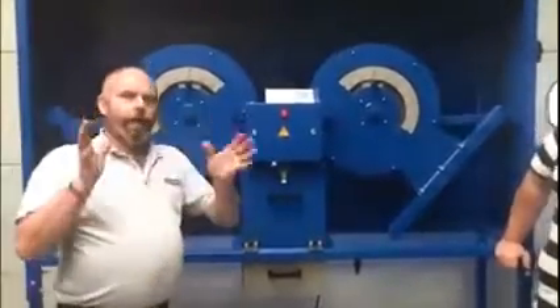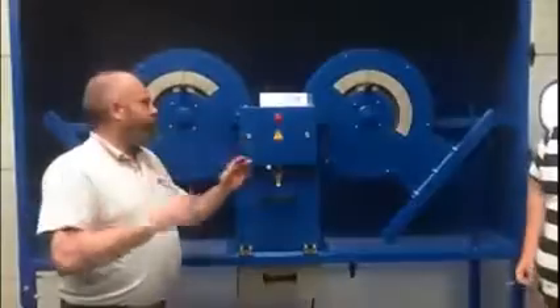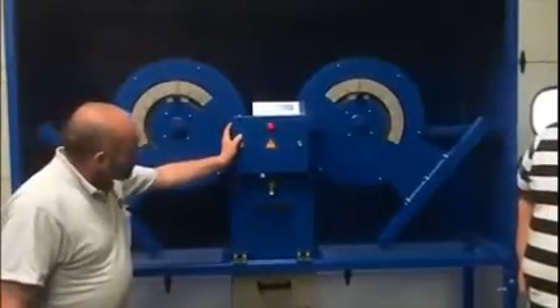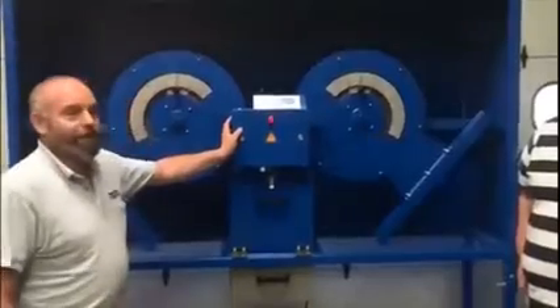To operate it you have to use two hands. If you push the buttons separately it will not do anything.